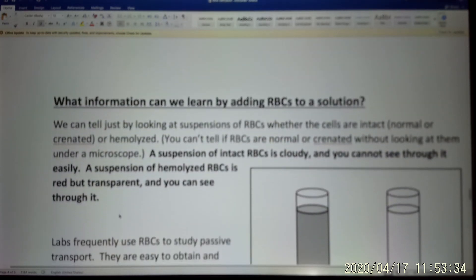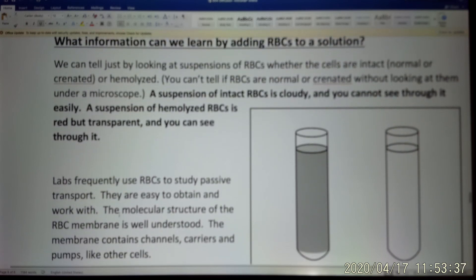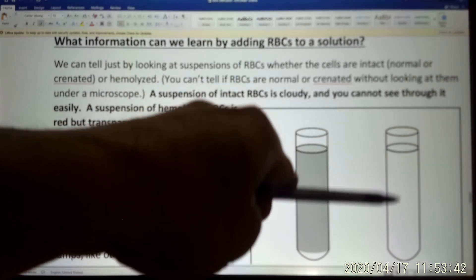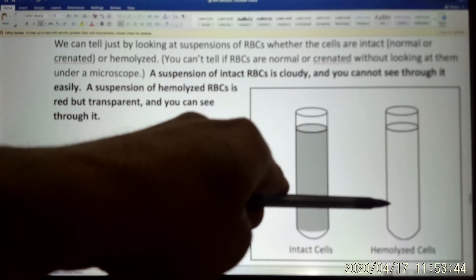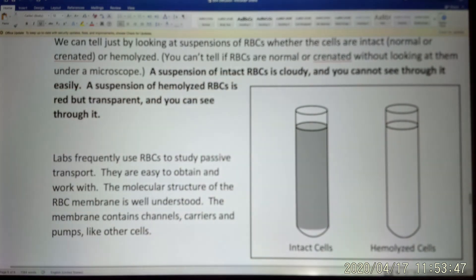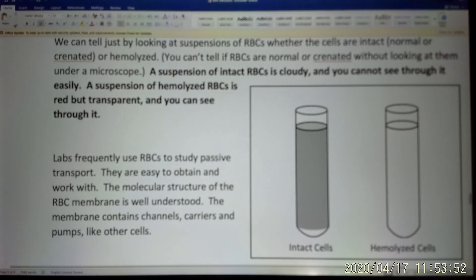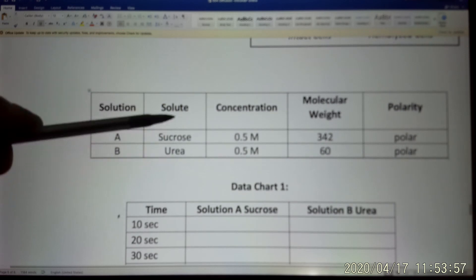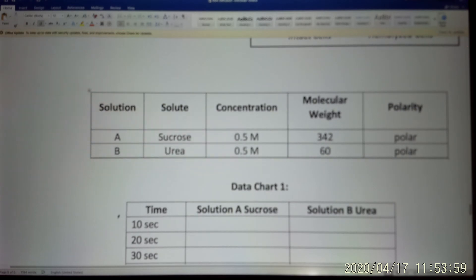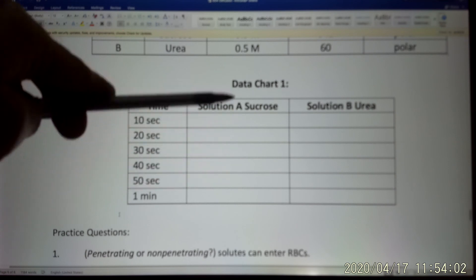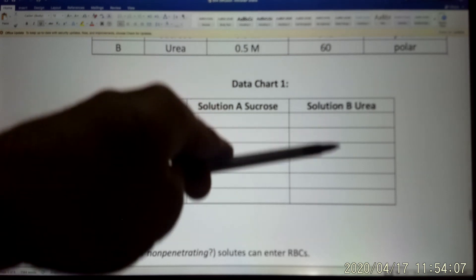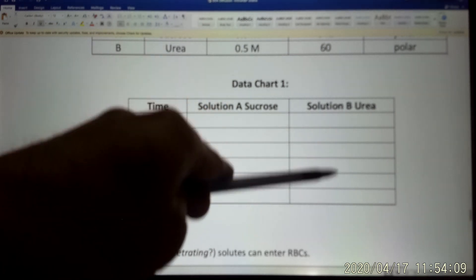So the third experiment shows that after the experiment, the sample with sucrose still looks like blood. But the sample put into urea — the blood becomes hemolyzed, becomes very clear. We prepared the two solutions at the same concentrations and measured them over time. The sucrose solution still remains like blood, and the urea one, after about 30 seconds, becomes clear.